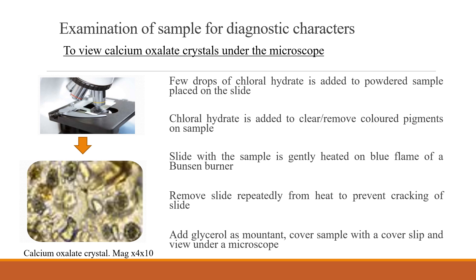The slide with the sample is gently heated on a blue flame from a Bunsen burner. While heating, care is taken not to crack the slide, so the slide is repeatedly removed from the flame. After the process of heating, glycerol is added, the sample is covered with a glass cover slip, and viewed under the microscope. This is an image representative of calcium oxalate crystals that can be seen under the microscope.